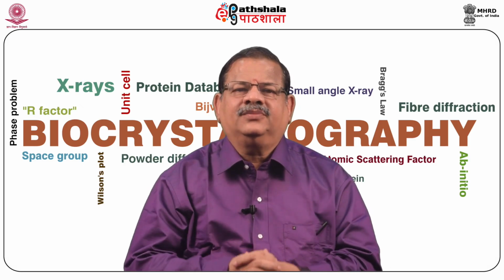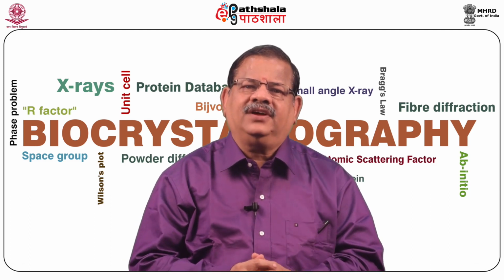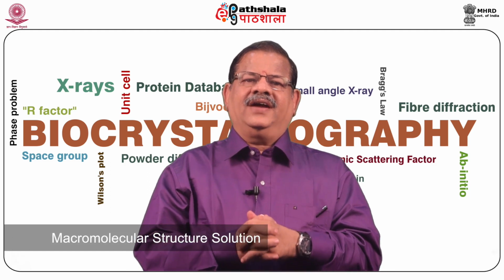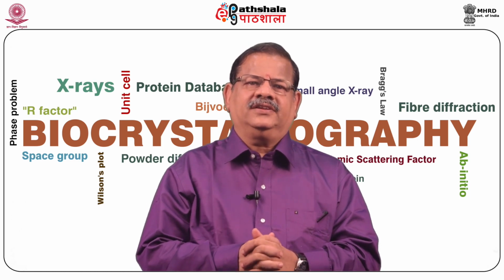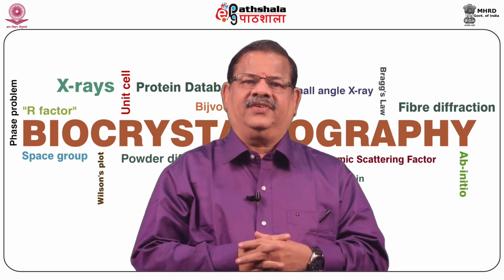Let us now consider the program suite PHENIX. PHENIX is a comprehensive Python-based system for macromolecular structure solution developed mainly by Paul Adams' group, and Tom Terwilliger has a major role in it. Publications deal with PHENIX. So one reference I have given.